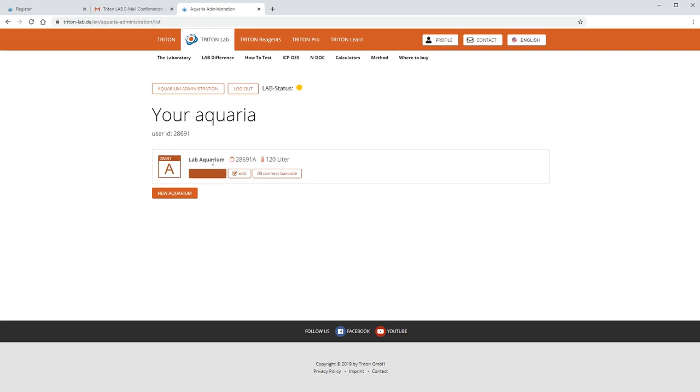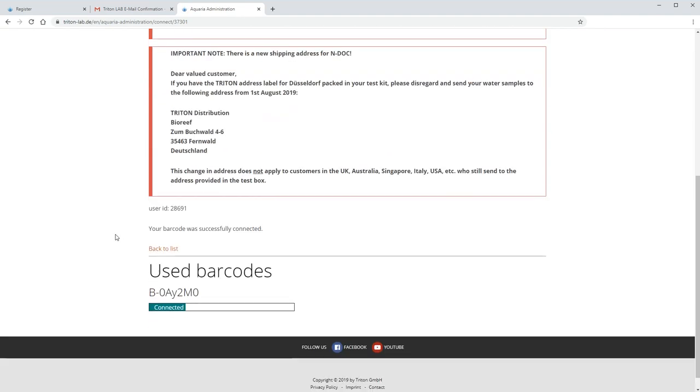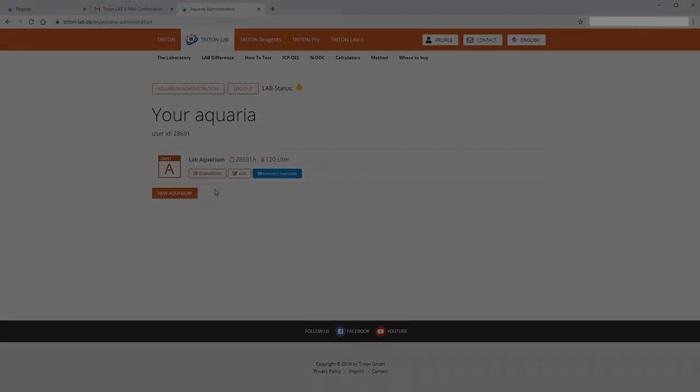And after you've done that, it's time to connect the barcode. I'm going to give away my profile so you can just watch my ICP test. So no need to copy-paste my barcode, it's already been in use. So let's jump to my aquarium.